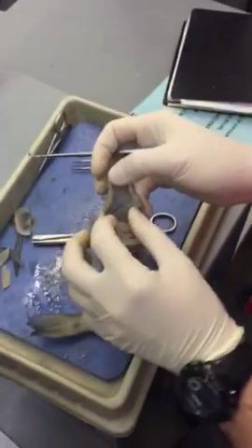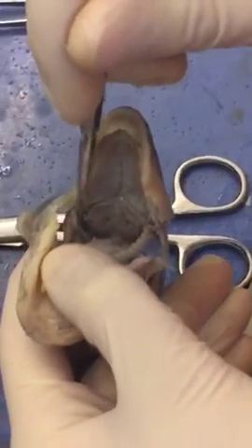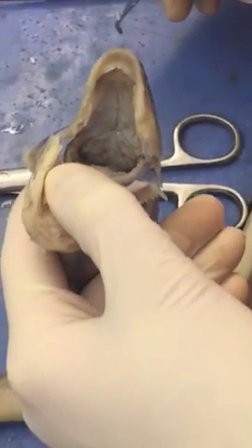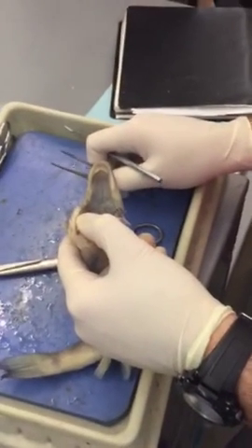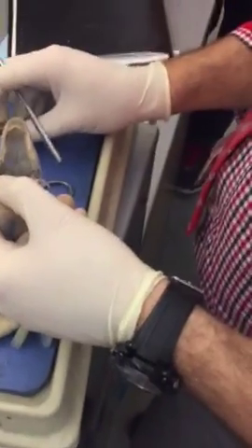The gill rakers are not teeth — fish do not have teeth. Fish that do have teeth would be piranhas, and barracudas I think have teeth also. Sharks do as well, but sharks are a separate class.